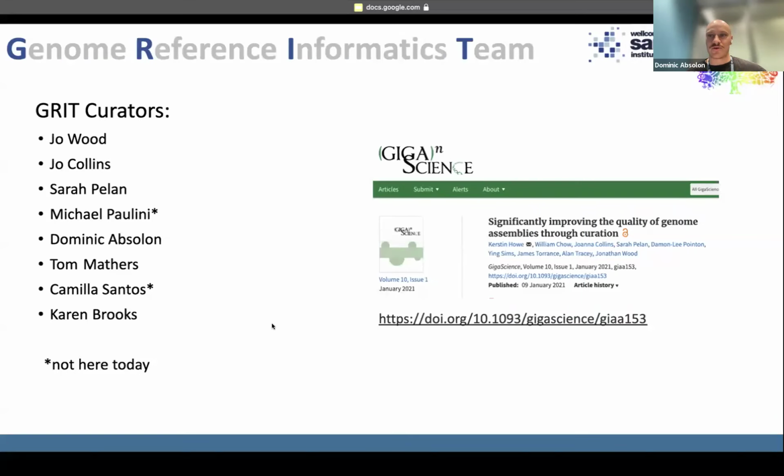So that's a brief overview of manual curation. Once again, we're the GRIT team at Sanger. This is the list of curators who are present today and will be answering your questions if you have any.